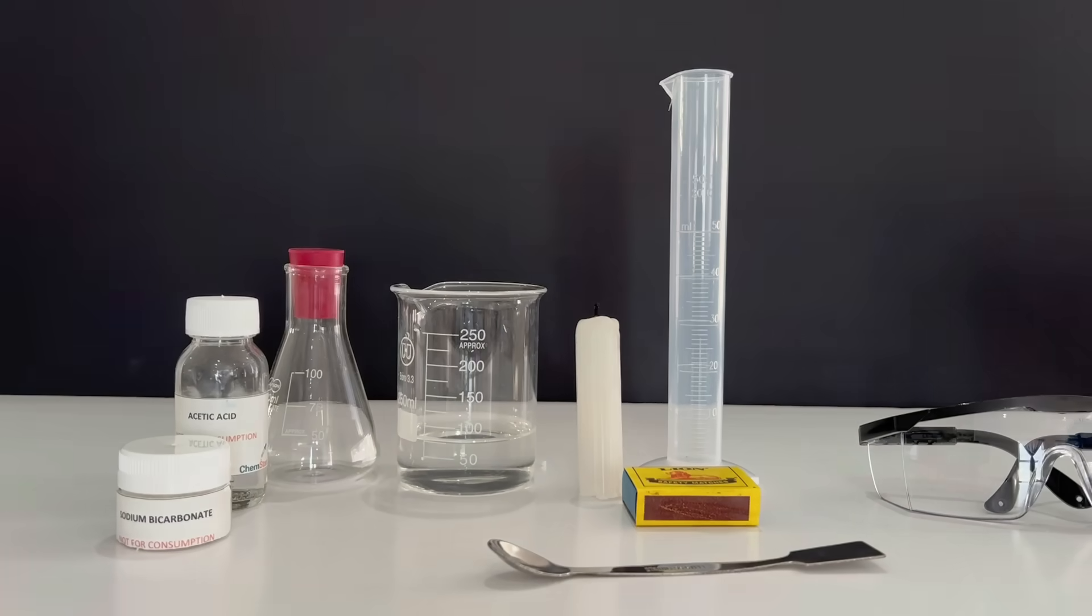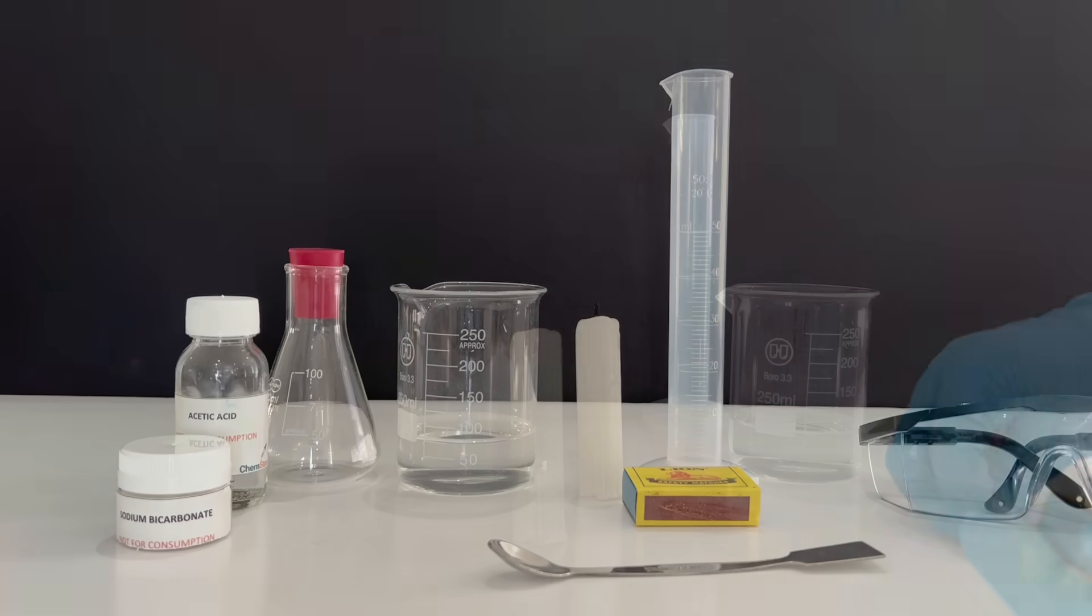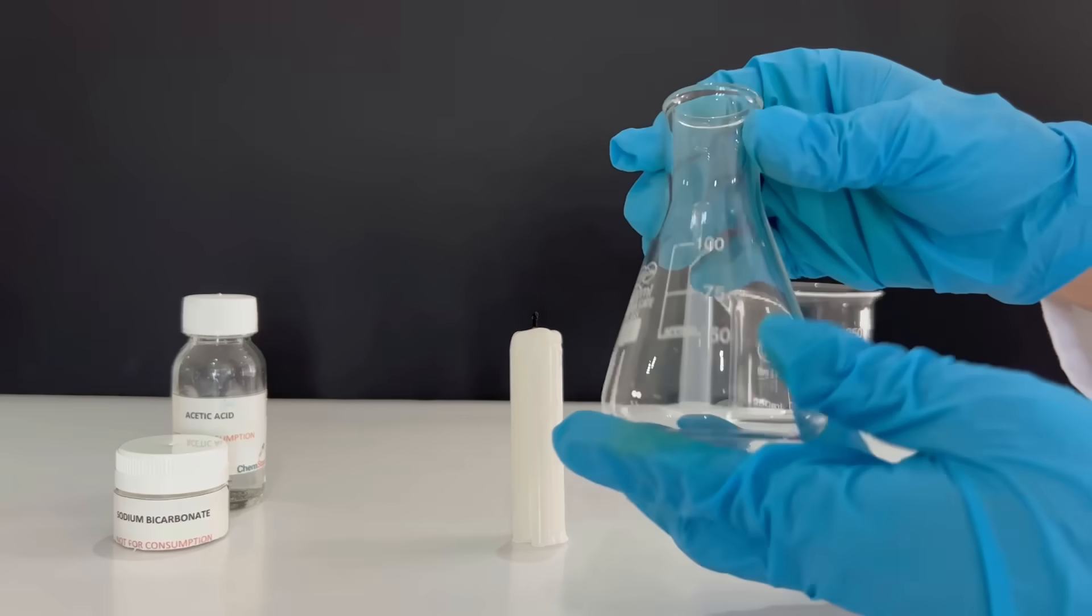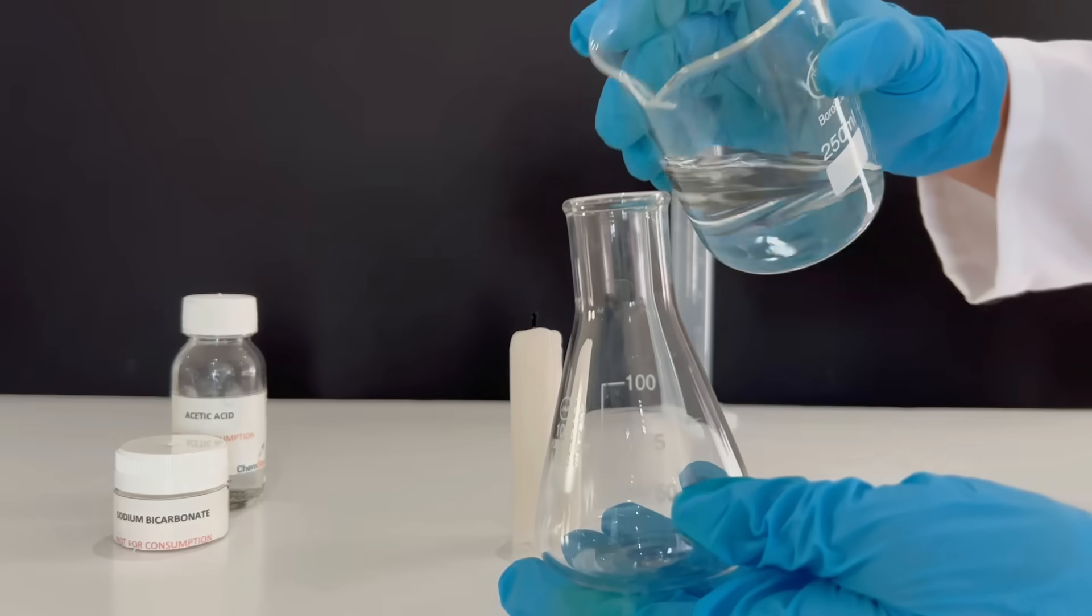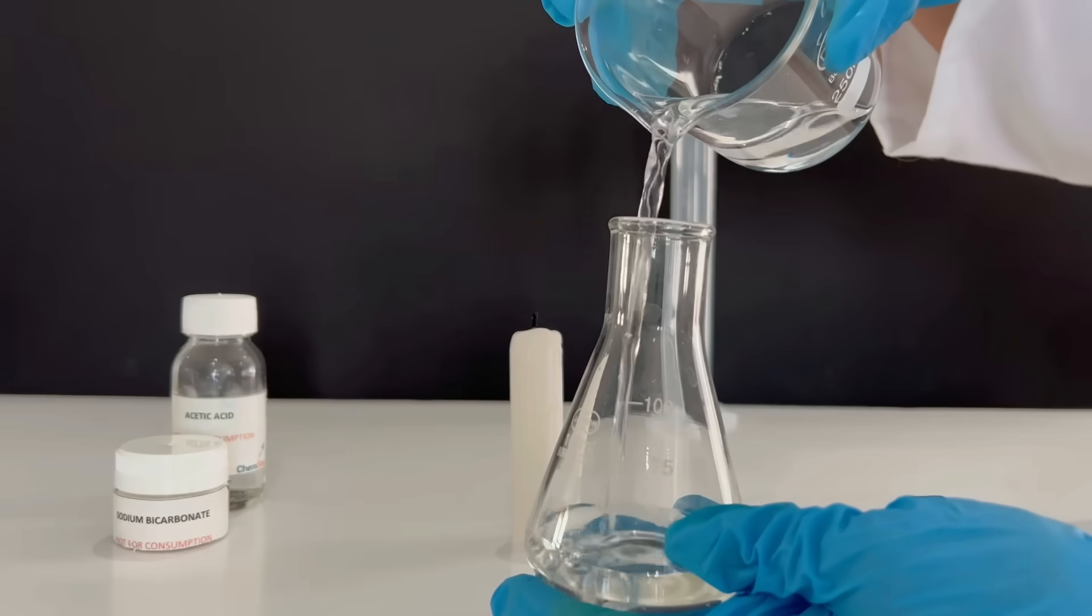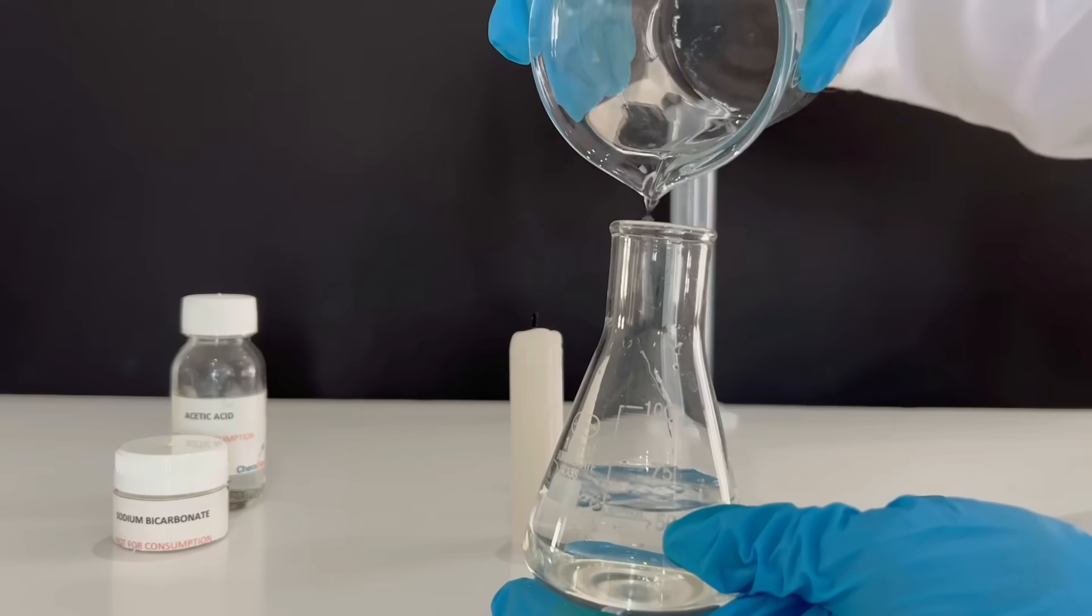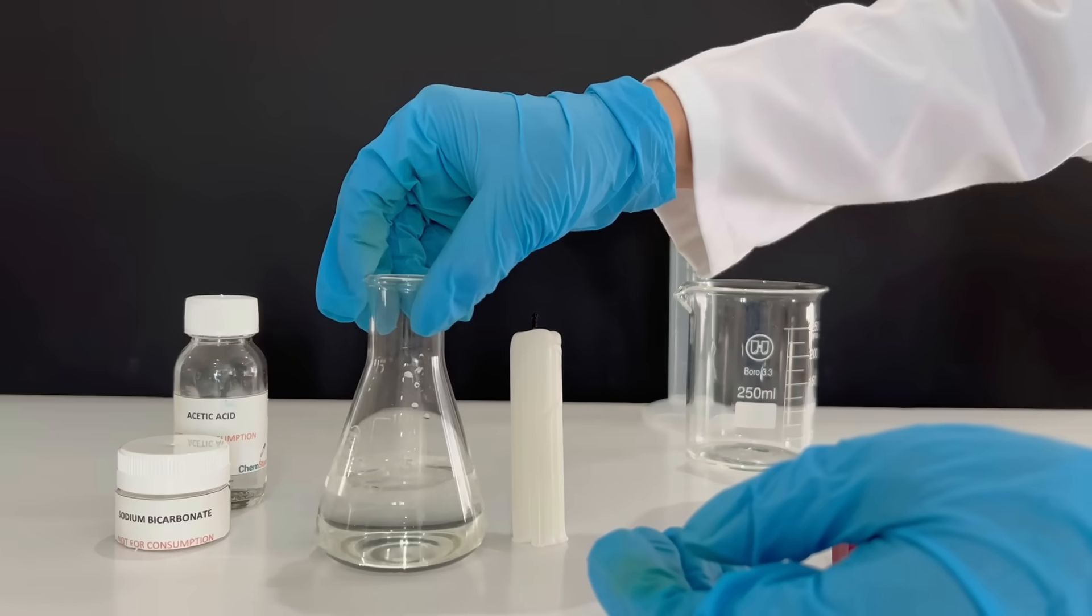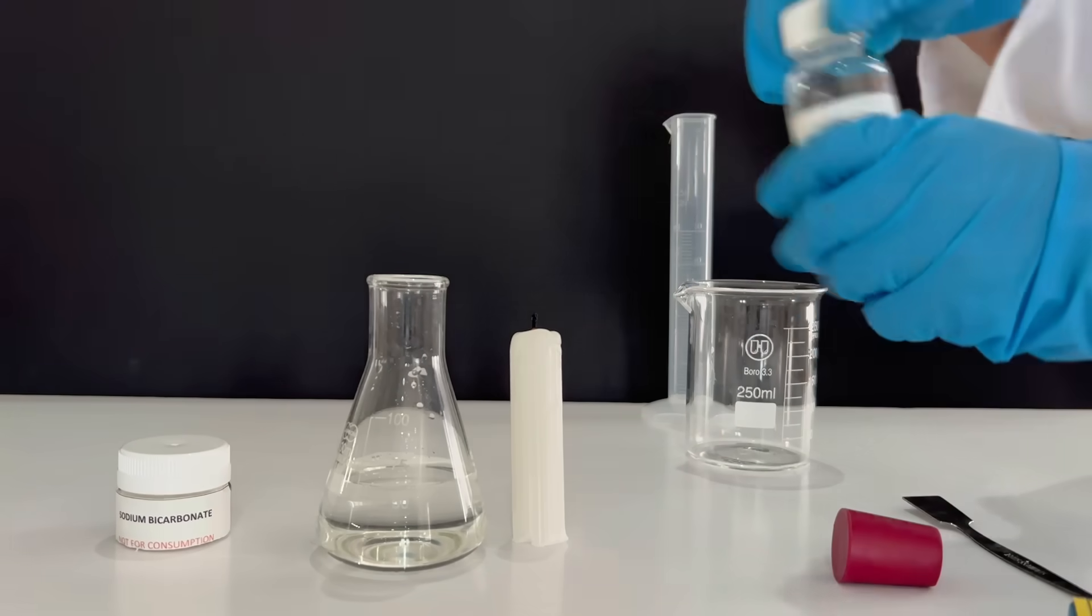So here we have all the materials. Let's set up the experiment. First, get your Erlenmeyer flask ready and add the 75 milliliters of water into the Erlenmeyer flask. Try not to spill.